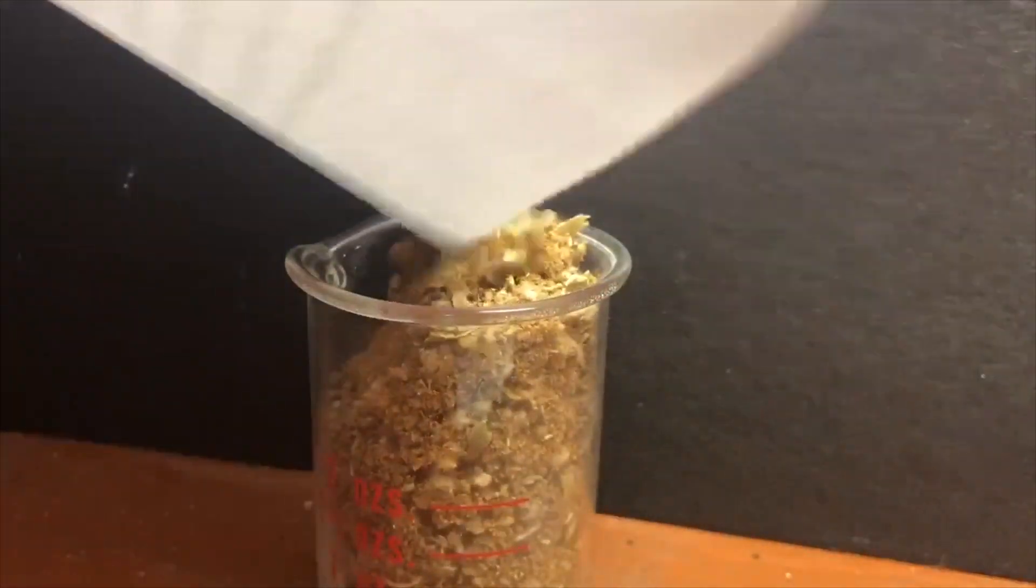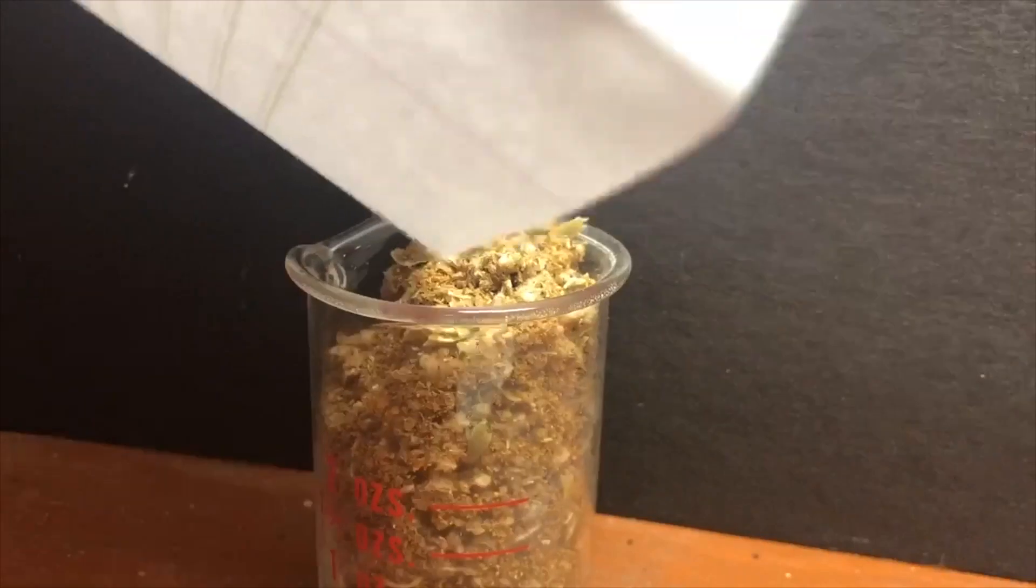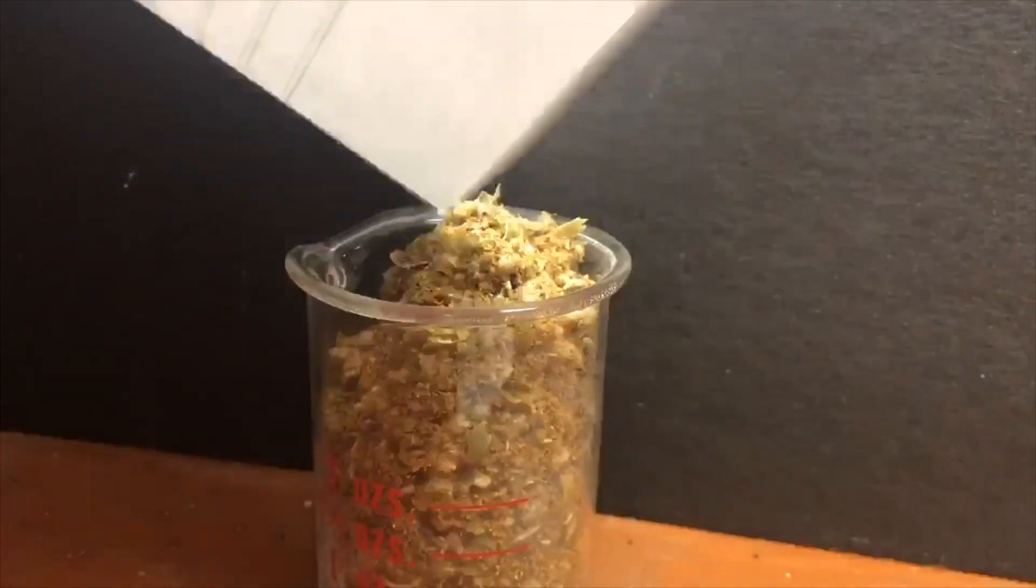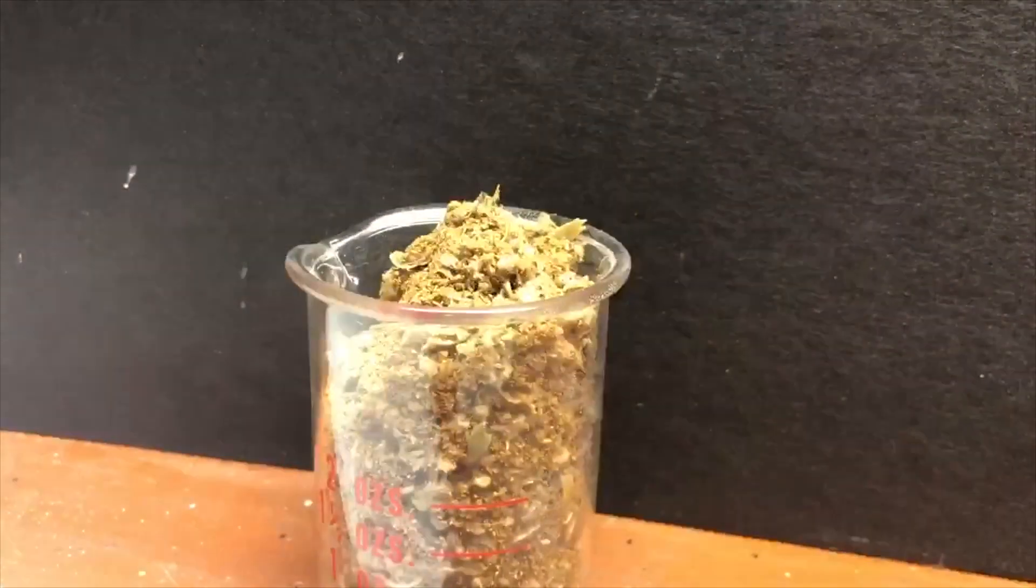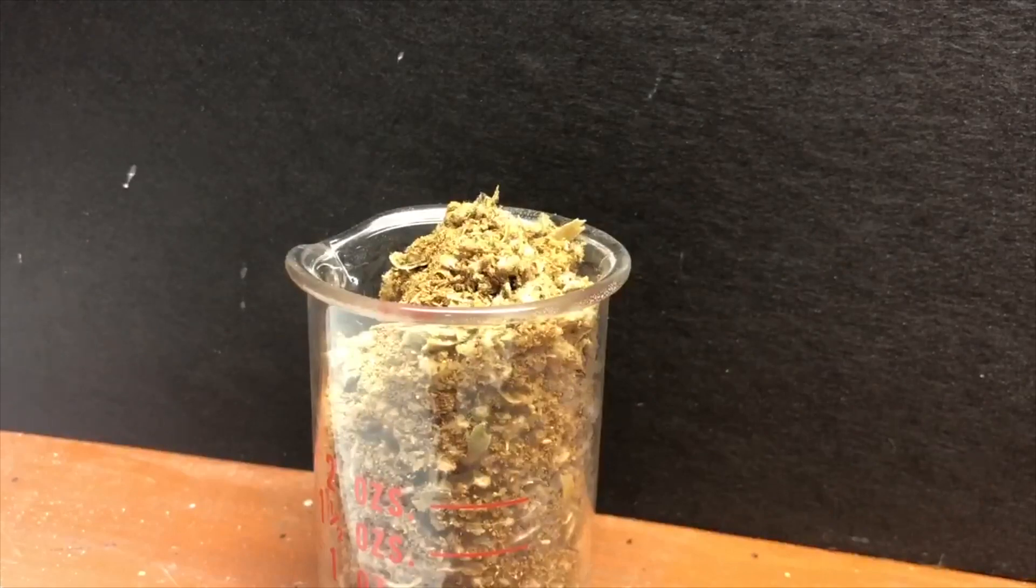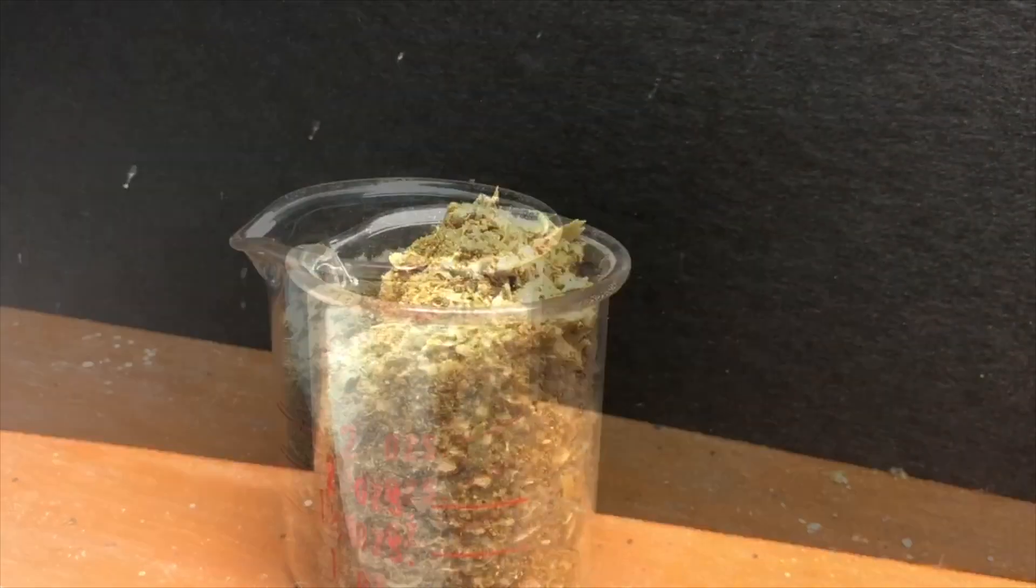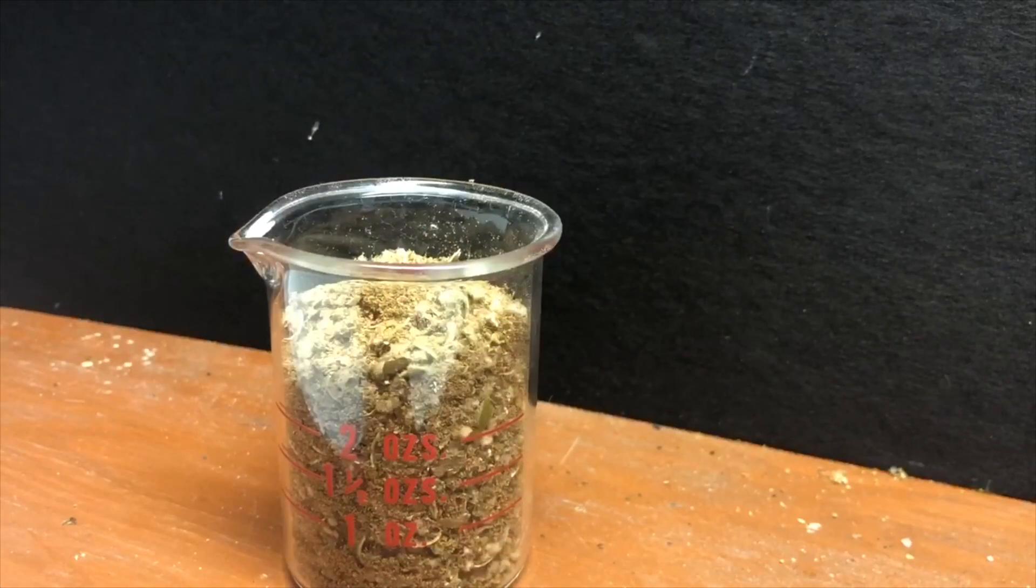So what we're going to do here is add up all the ground up acorns into a beaker, and we're gonna top it off with methanol, and this should extract all the tannins. The tannins are water soluble and alcohol soluble and soluble in most other polar solvents, so you could pretty much use anything. I'm just using methanol in this video.